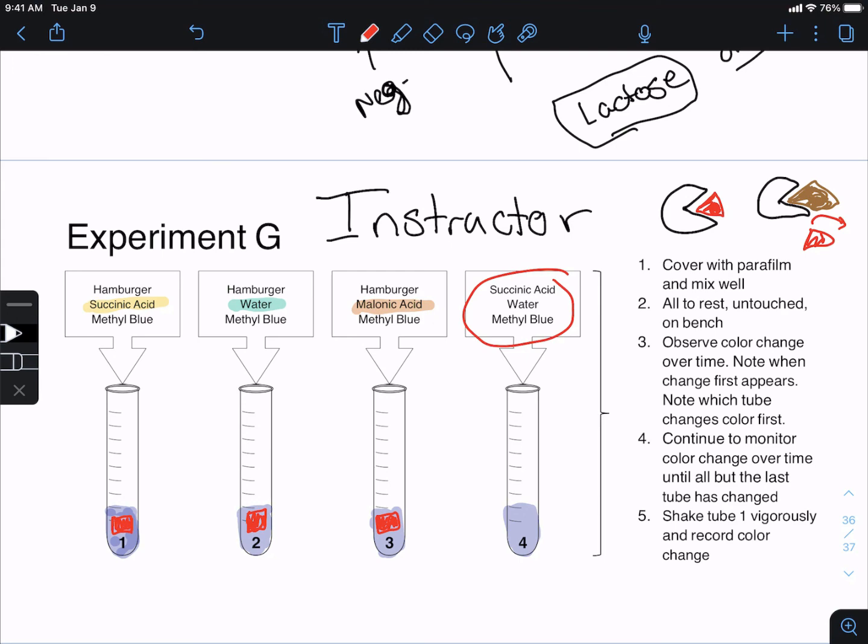The hamburger in this reaction is my source. Hamburger is essentially skeletal muscle and fat and blood vessels and tendons and all sorts of stuff ground up, right? Yummy. And the skeletal muscle contains a ton of mitochondria.